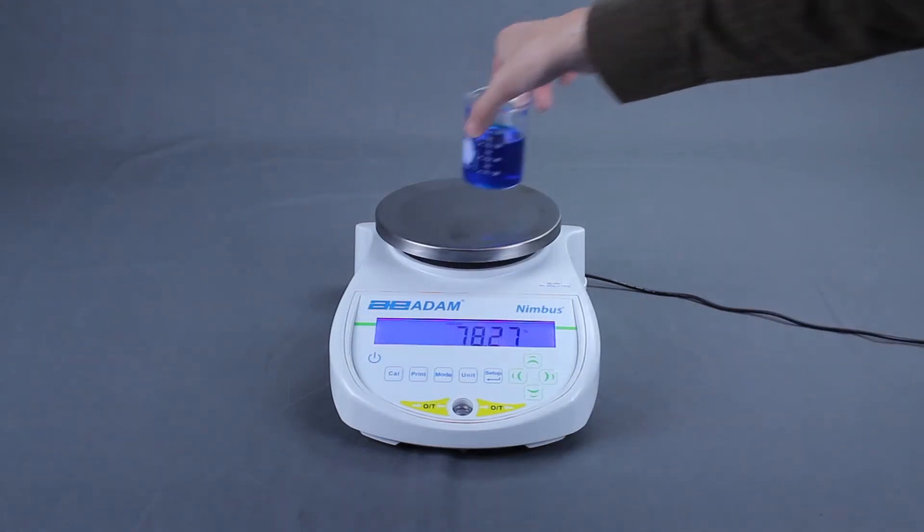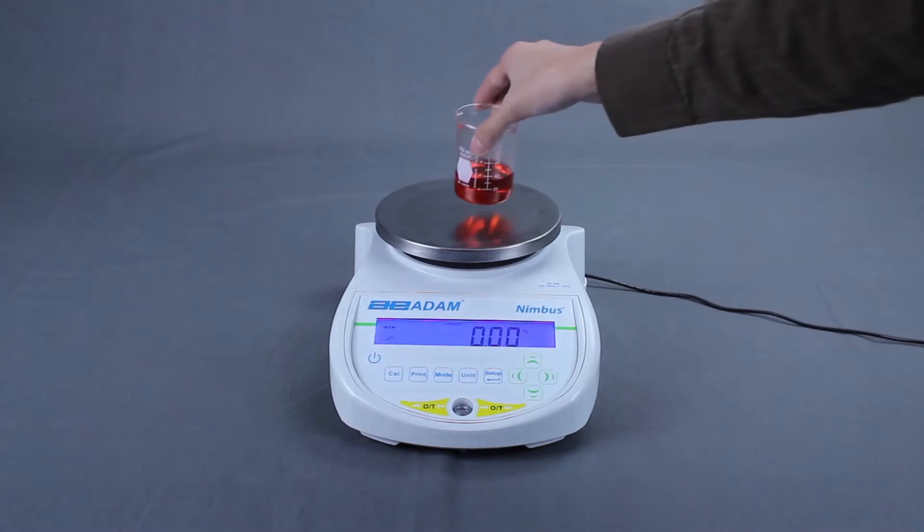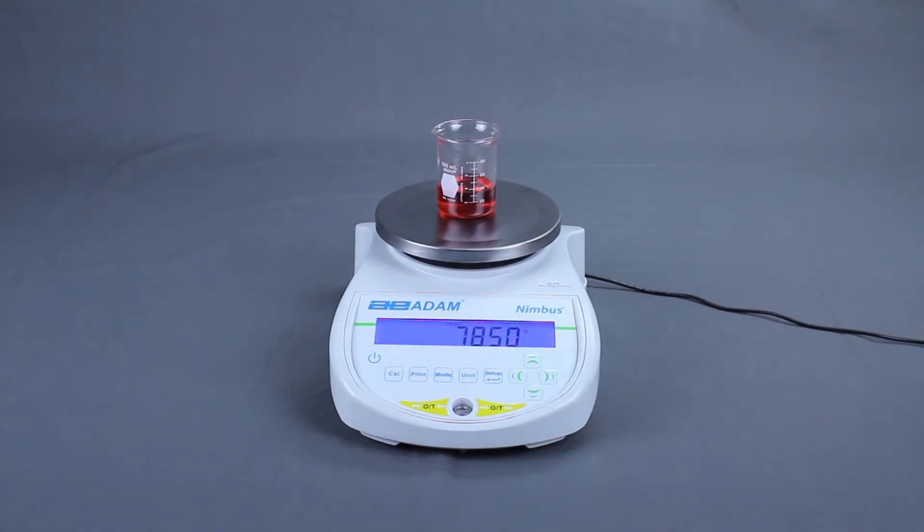Remove the reference sample and place unknown samples on the pan. Read the sample weight as a percentage of the reference.